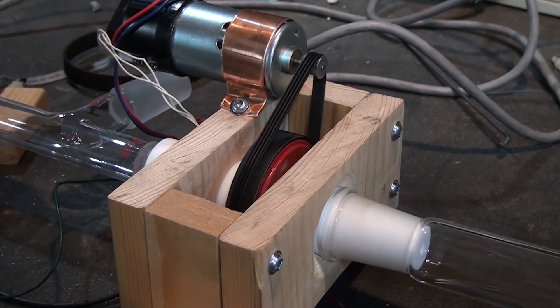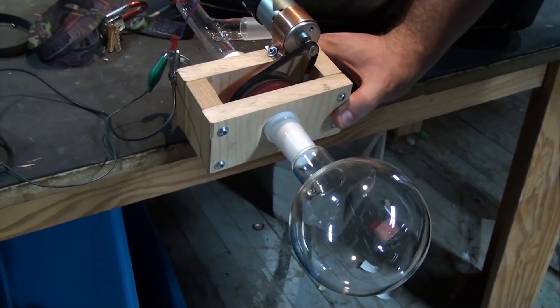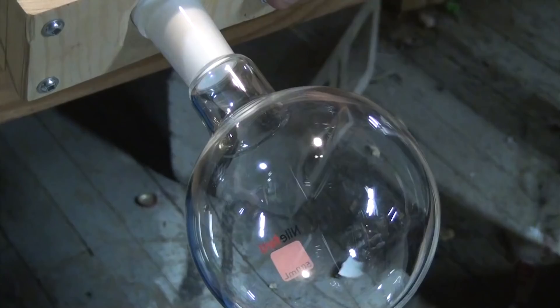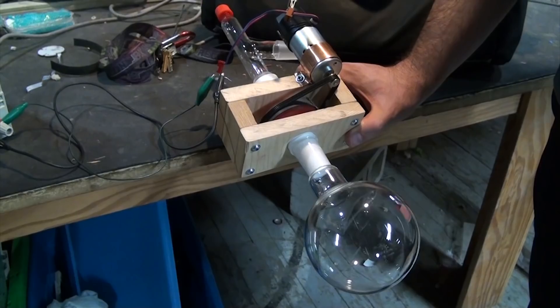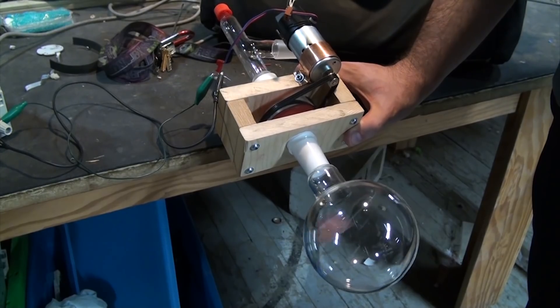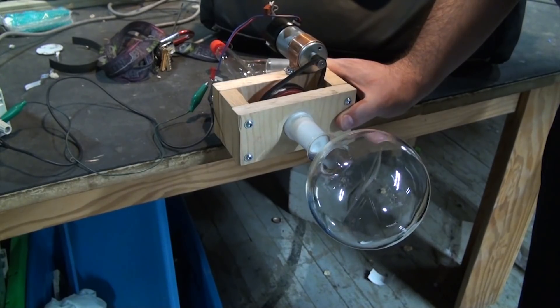All this needs is a bit of power, and it instantly starts turning beautifully. Here it is with some more glassware attached — I've got a thermometer elbow at the top, and one of my Nile Red flasks at the bottom. Just by varying the voltage, I can control the speed pretty smoothly, and unless I really go crazy on the speed, the top half is essentially undisturbed, which is exactly what we want.